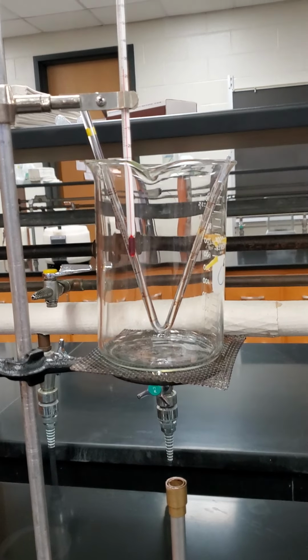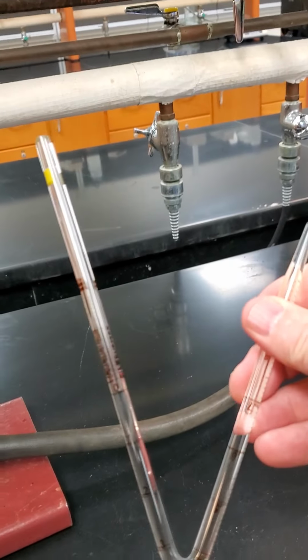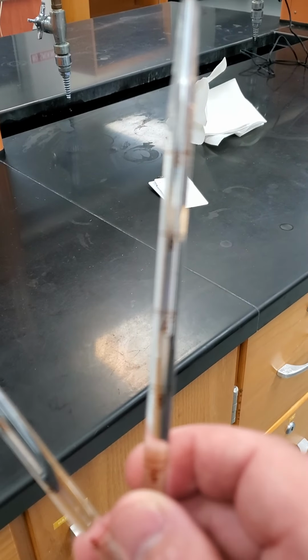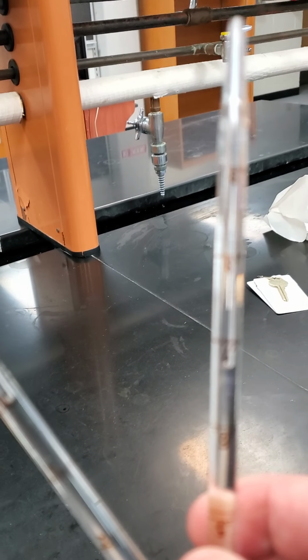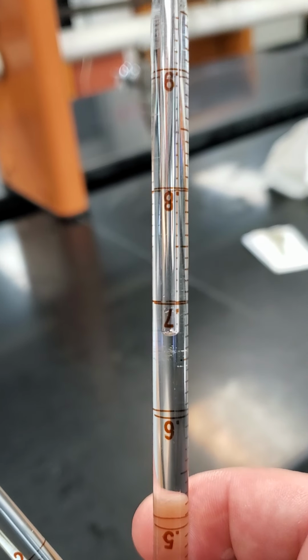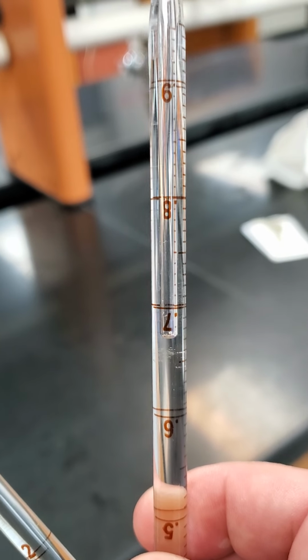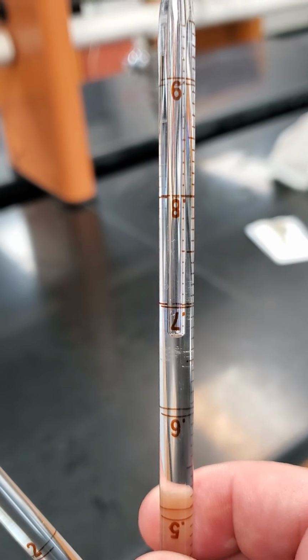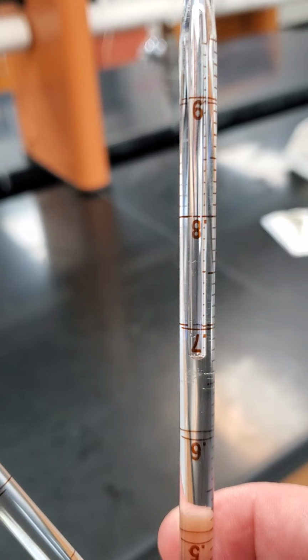So what we're going to do is, we have this thing here. It's called the Charles Law apparatus, and it's a 1 mL pipette, which is really small. It's hard to see here, but there we go. See what it says: 0.6, 0.7, 0.8, 0.9. If you look at about 0.68, it looks like a bubble. Above that bubble is air.